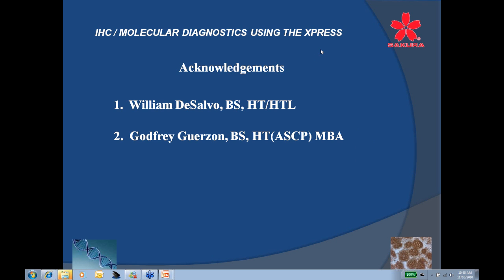Alicia? Well, thank you, Lamar. That was a very nice, informative webinar, and I'm sure the audience did appreciate it. I do have a few questions, and the first question is, what about resection borders in bigger specimens like breast resections and smaller Paraform cassettes?